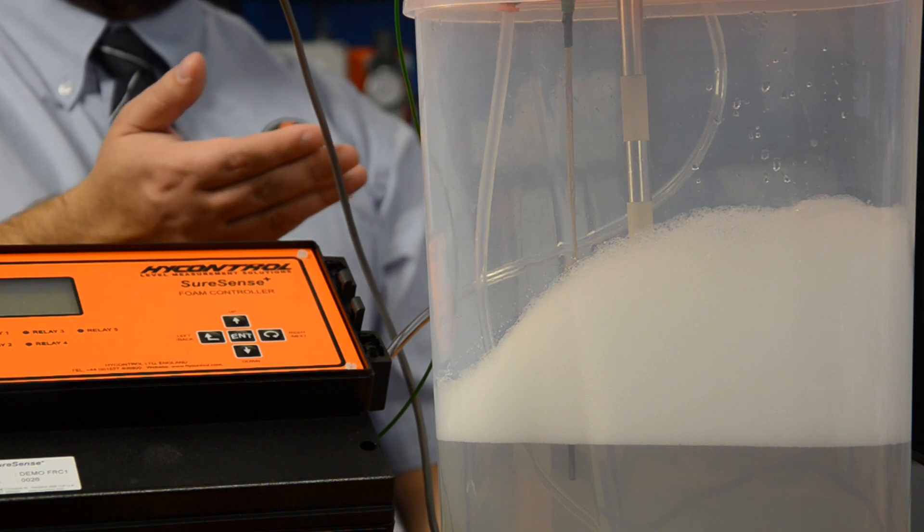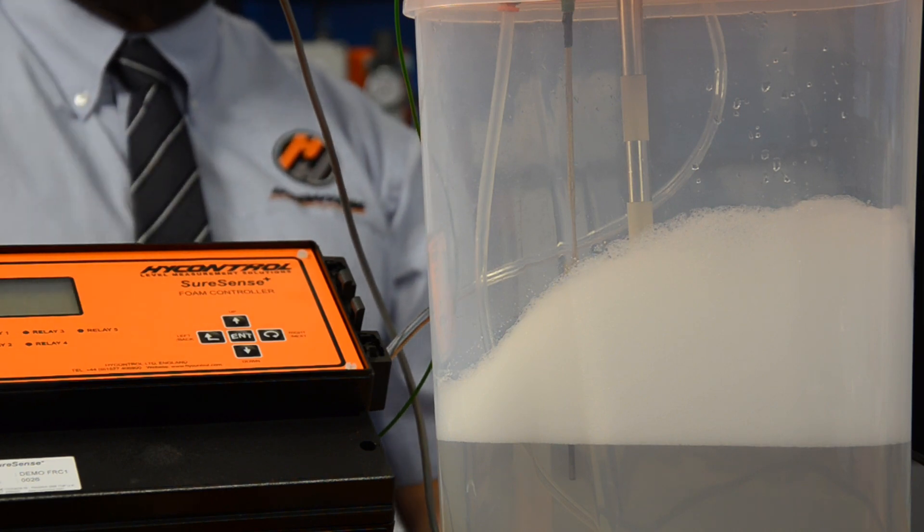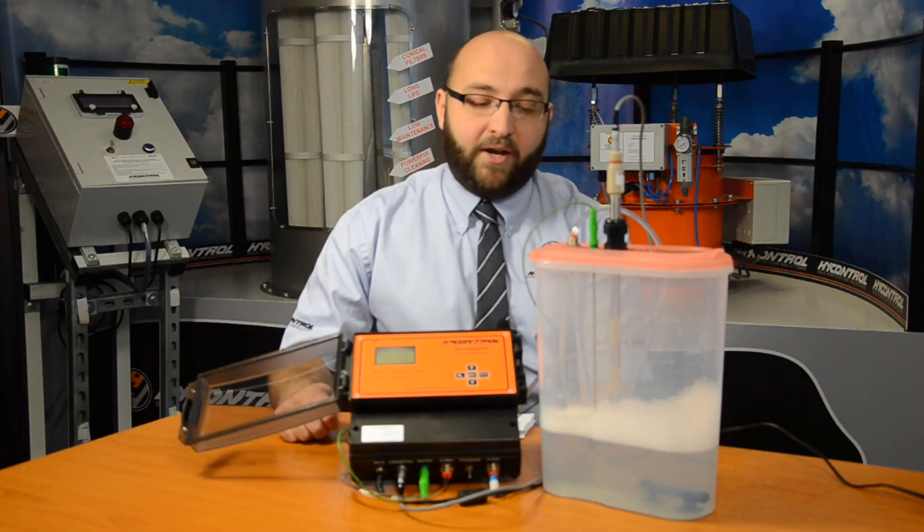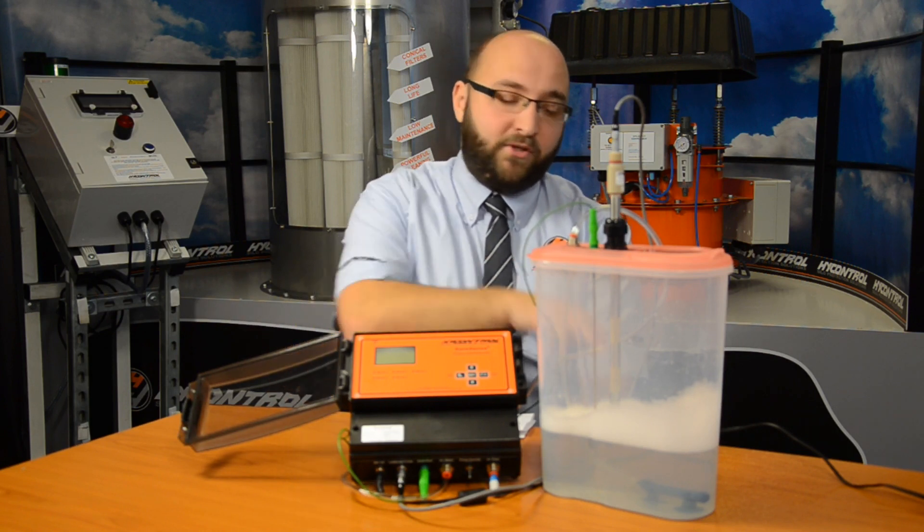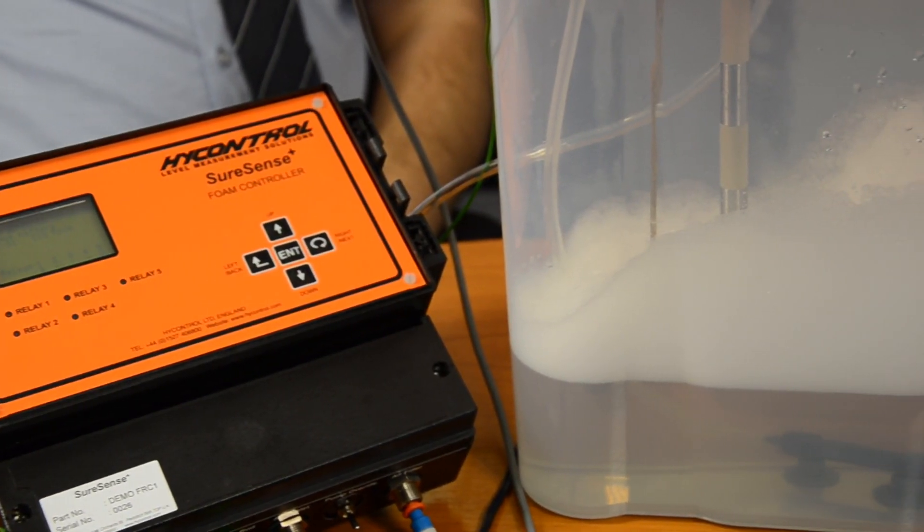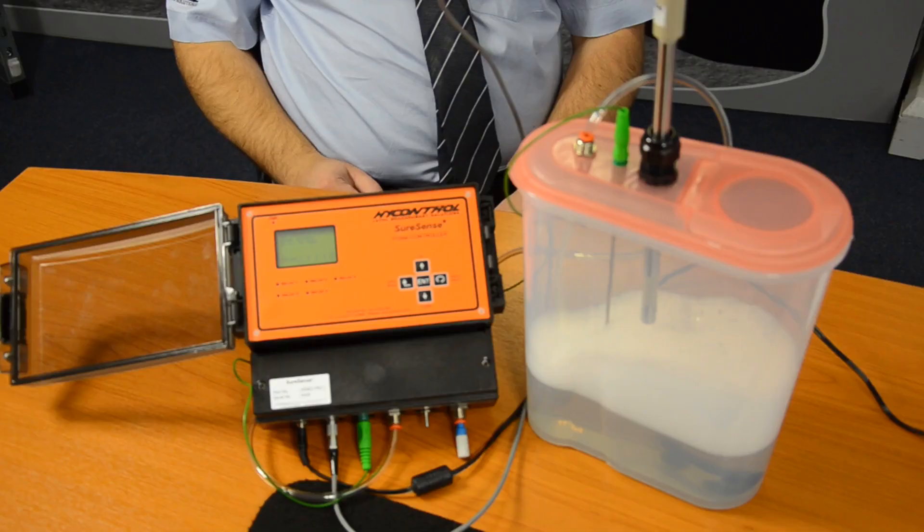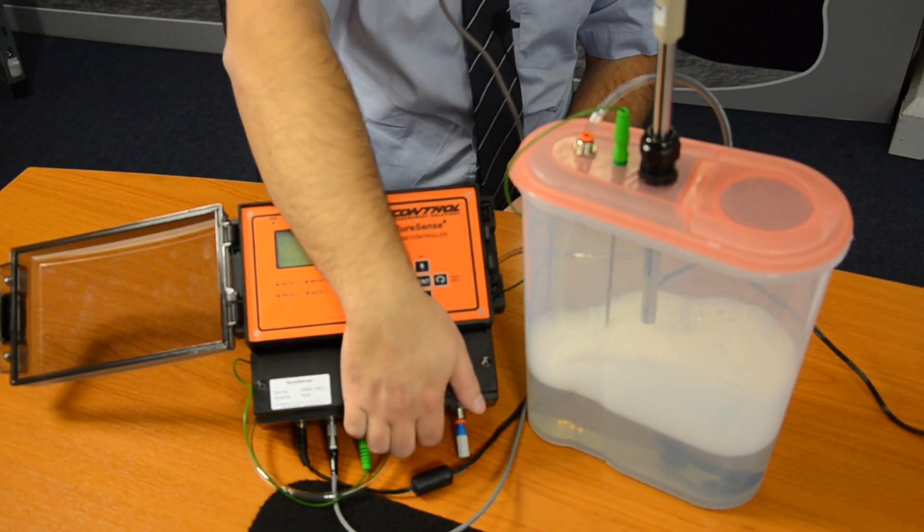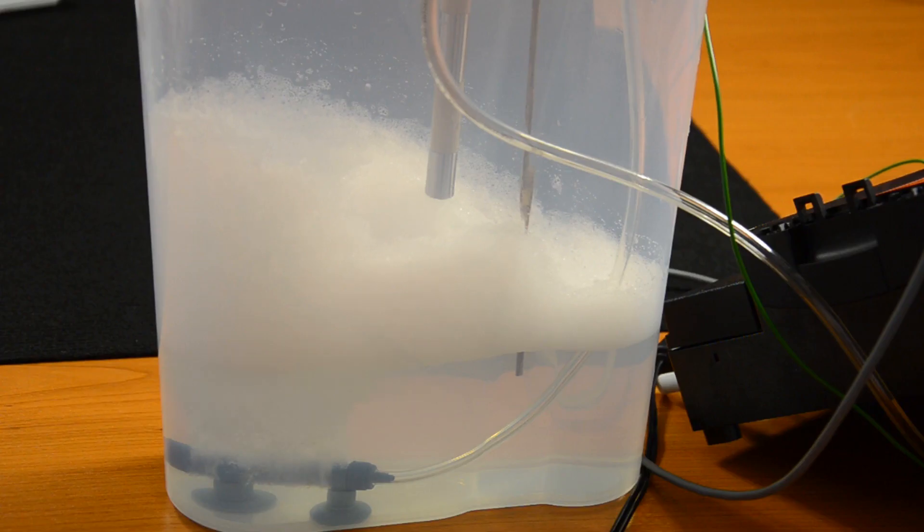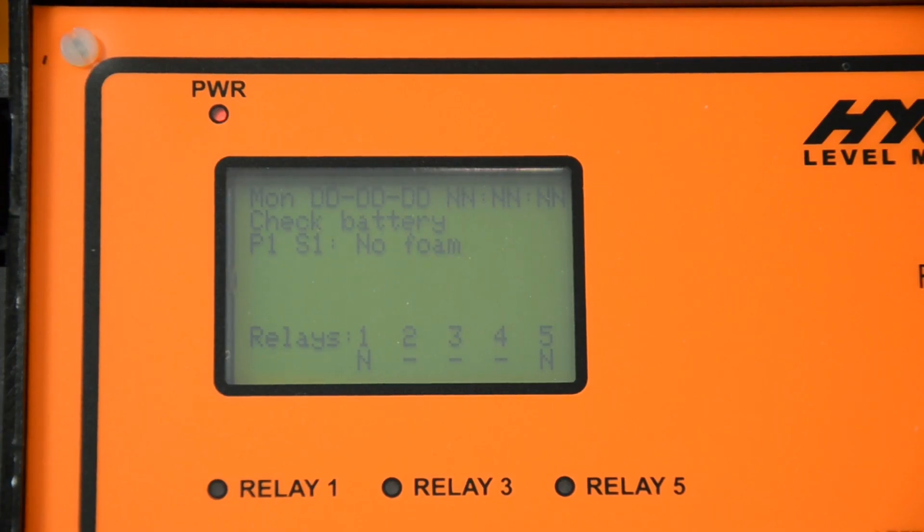So this is our foam demo kit and we've wired it up today to work in reverse to how you'd see it in an application. Whenever the foam isn't present we'll turn on the pump below. This will create a foam column and then trip the relay and stop the pump. As you can see the SureSense Plus can detect foam straight away, even the really light foam.